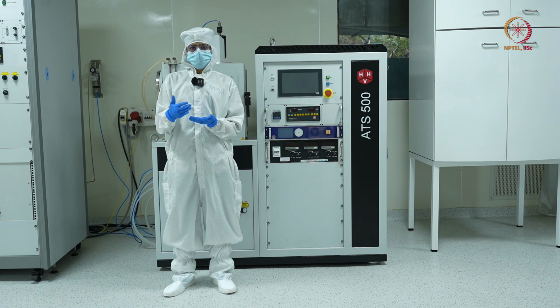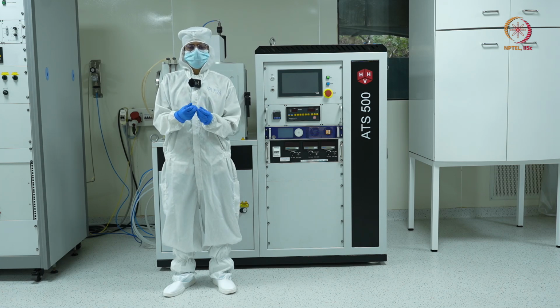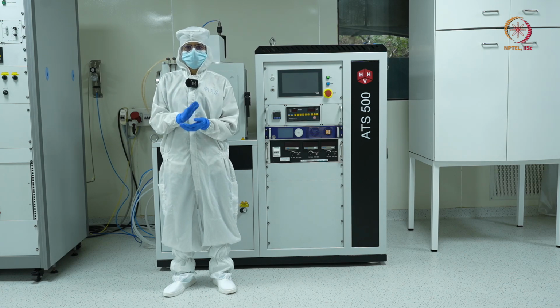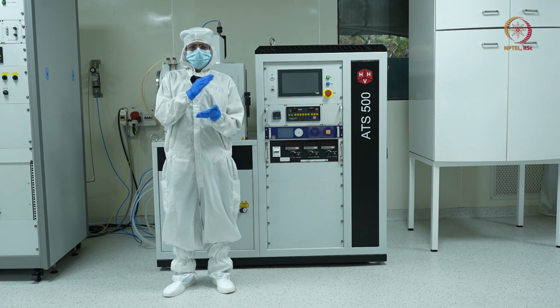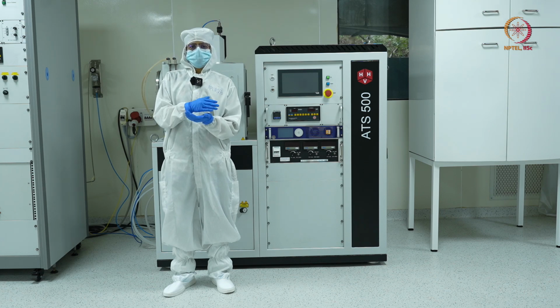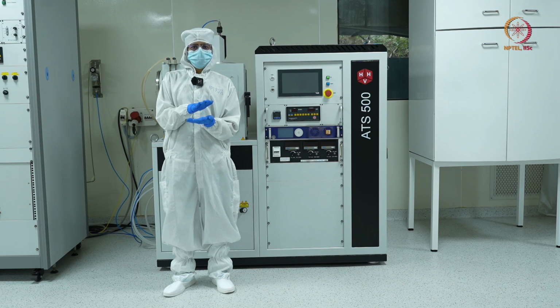Now, in physical vapor deposition, we are physically either melting the material or bombarding it with gases, and the dislodged target atoms come and deposit onto the substrate. In this process, the chamber where we are depositing our material should be under vacuum.